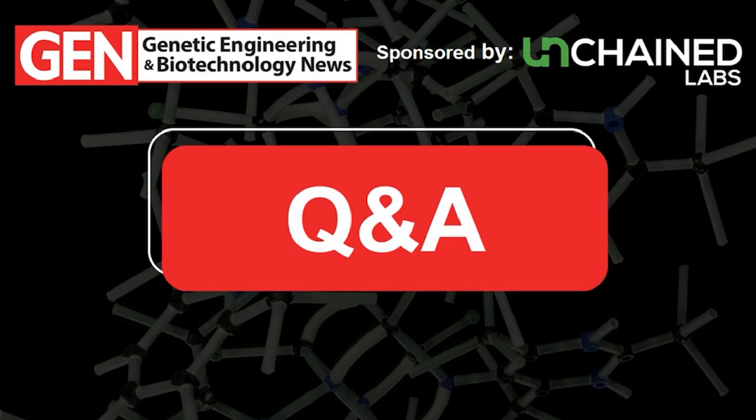But maybe I can expand on this answer. The way that you compare assays and methodologies, either ones that currently exist or ones in the future, is really going to be through what I call well-characterized reference materials or well-characterized standards. And until we have those standards that we can use and basically show the behavior of these standards across the different methods, that's going to be really valuable data, rather than looking at the different ones and variability. So that would be my answer. There's a nice paper out there, but we can do more by doing some comparability studies with reference standards.